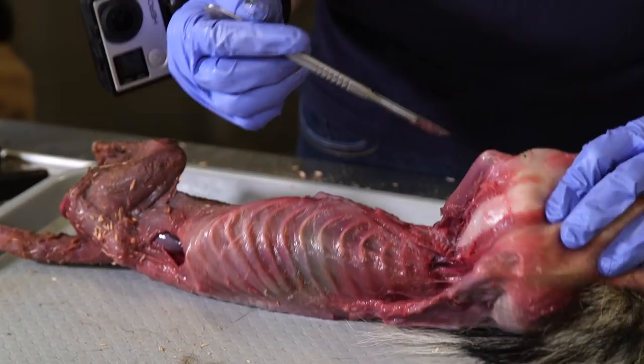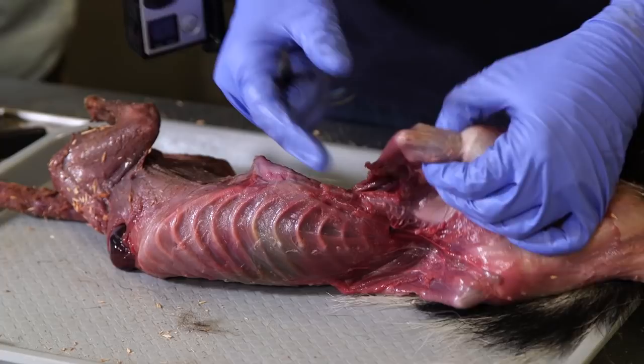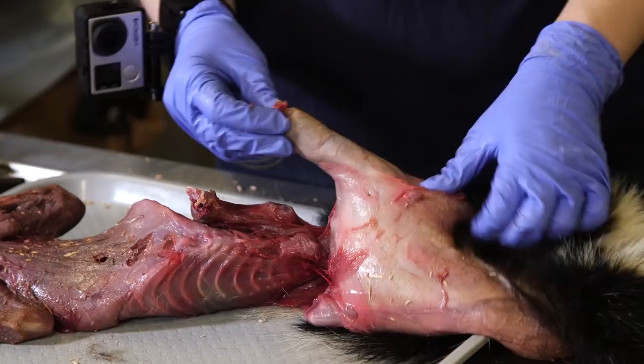I tell people it's just like pulling a shirt over your head, except it's your skin. You can see the little elbows sticking out, the little arms. I'll get those exposed — there's a paw — and then I'll do the other arm on the other side.